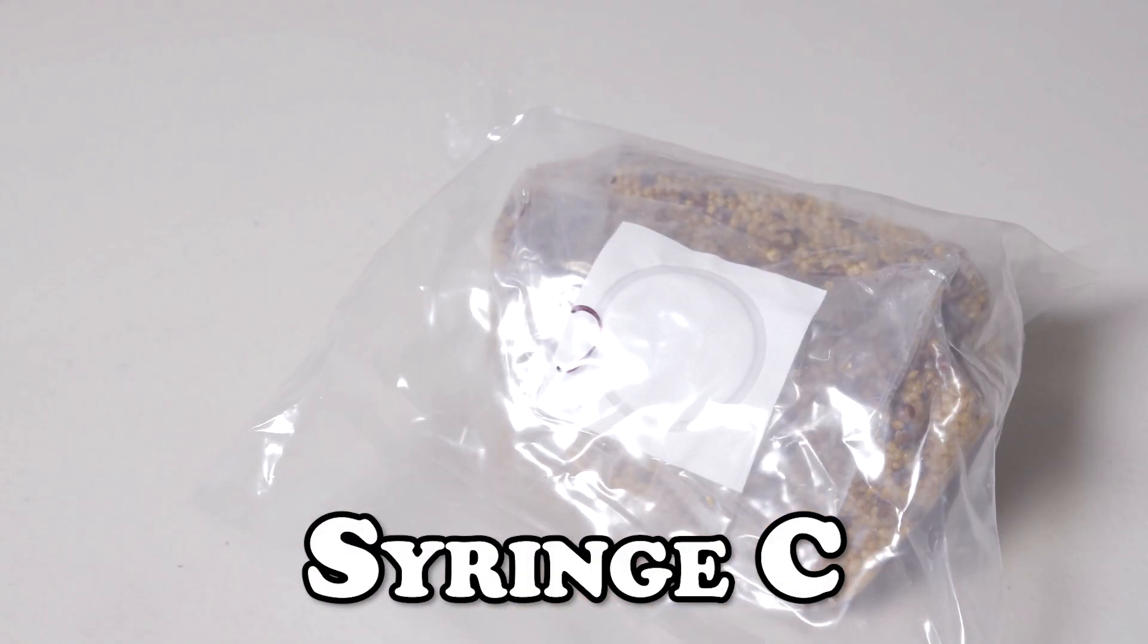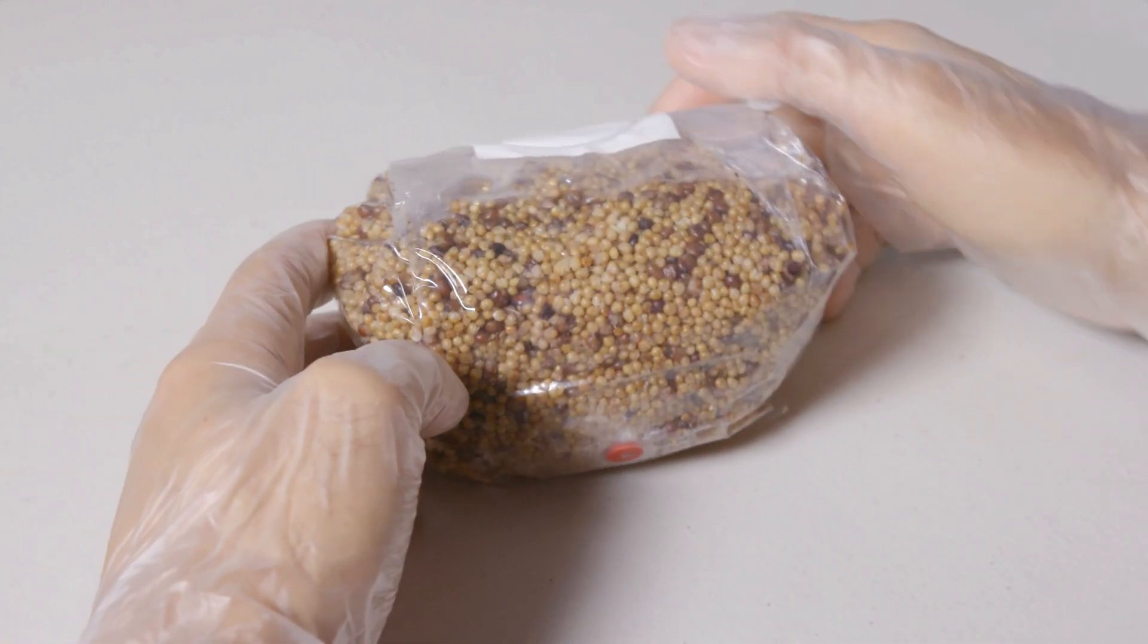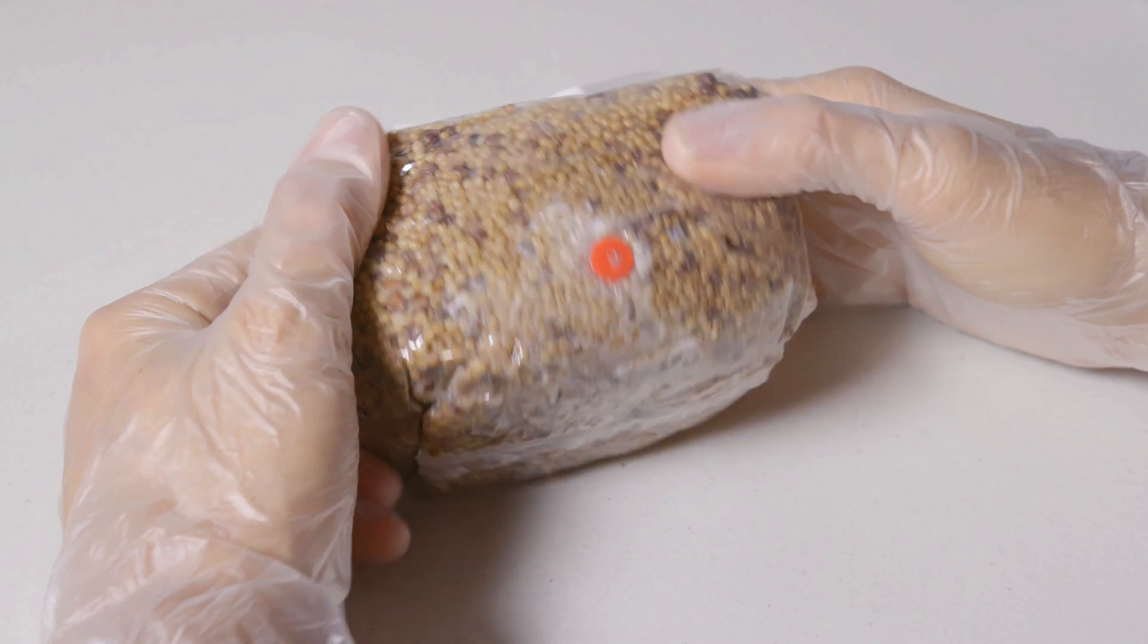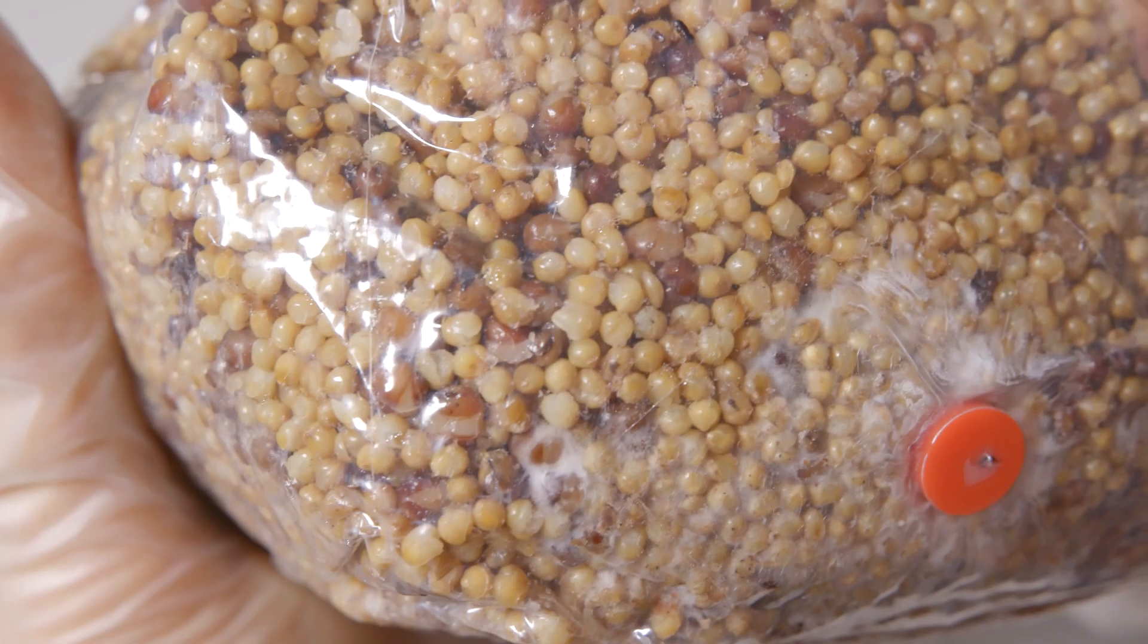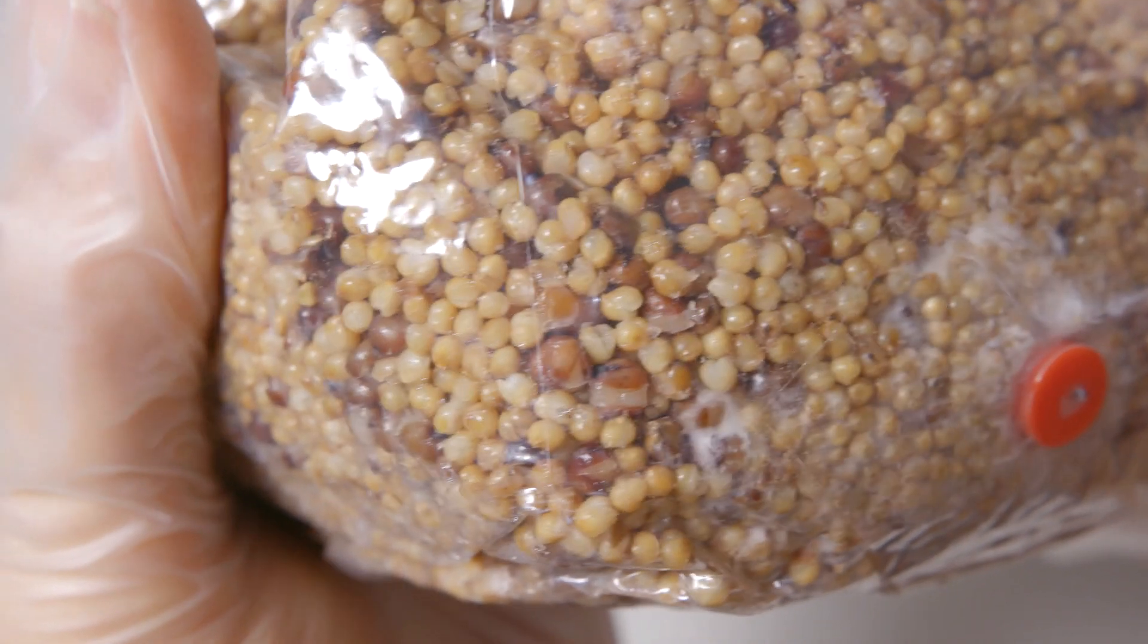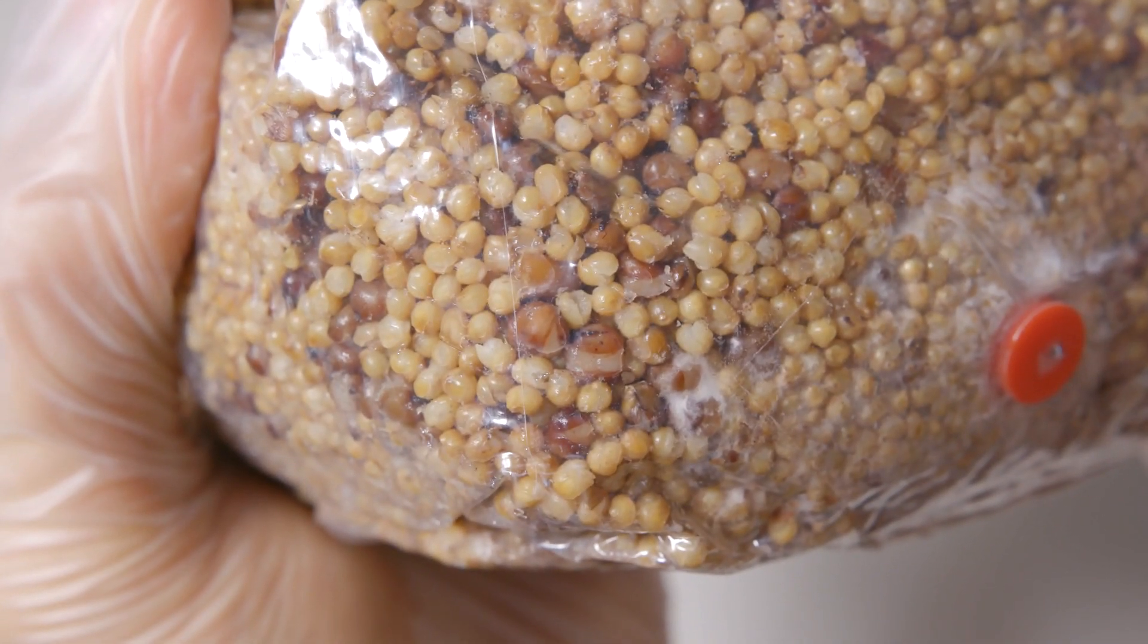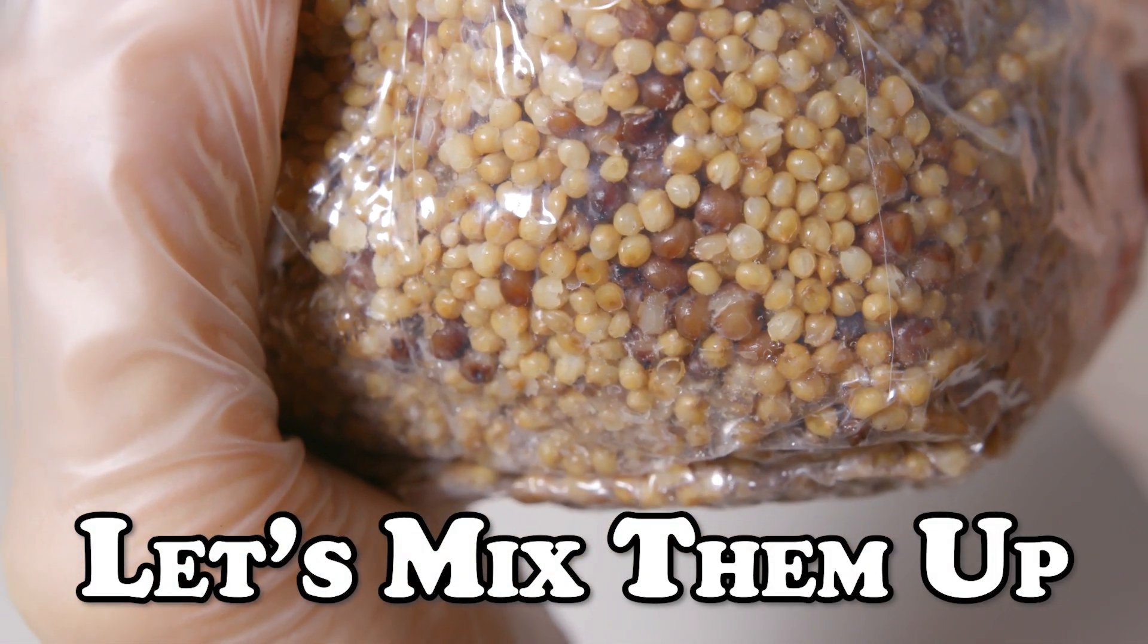Here's our last bag, syringe C. We do have a little activity by the inoculation port, however you'll notice that the mycelium is also a bit wispy instead of the nice white strands which we'd like to see. As we take a closer look we'll notice that a bit of condensation is forming around the grains, which is normal. However, the grains themselves also have that glossy sheen indicating the beginning stages of bacterial breakdown. We'll take our three bags, mix them up, place them back into incubation and check up on them in two weeks.